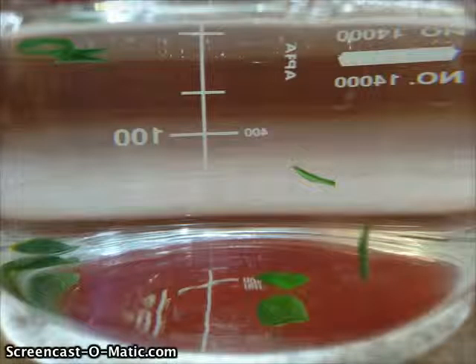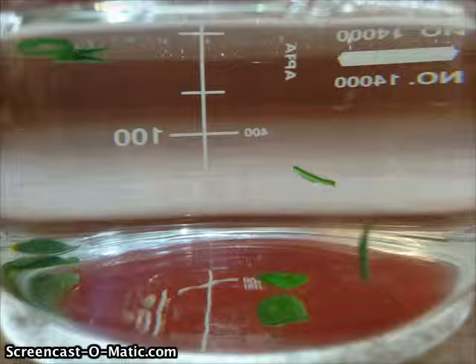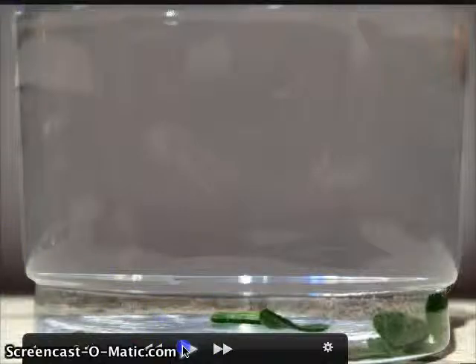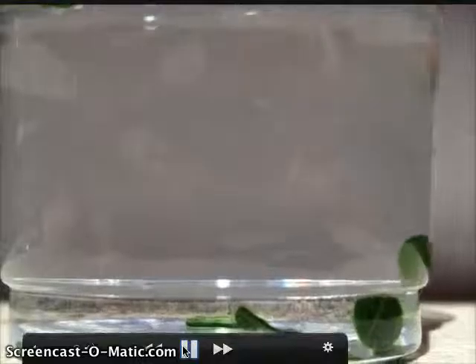And of course, as is the case with science, some groups had greater success than others with their given variables, and some groups, like the group that decided to vary the light color reaching the leaf discs, have to do a redo, possibly with a thinner layer of cellophane because they couldn't generate any floating discs at all. So they're going to be coming in for that this coming week. This was what we were hoping to achieve when we started out.